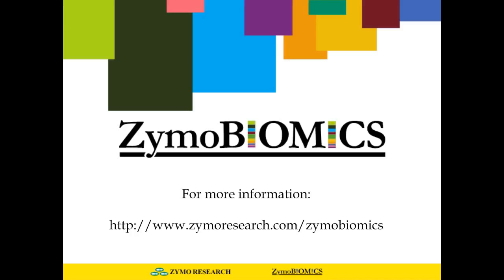Have you done long-term studies of the protective effect of the DNA-RNA shield? Can I get clarification if that is with respect to the stability of the DNA and RNA? And if that's the case, then yes, we have long-term studies. Actually, DNA is stable out for years. RNA is, we guarantee at least 1 month, but actually is stable even longer. And then, of course, we say ambient temperature at 30 days, but there's some variability there depending on if your ambient temperature, say, is 37 versus your ambient temperature is sitting at 15 all the time.